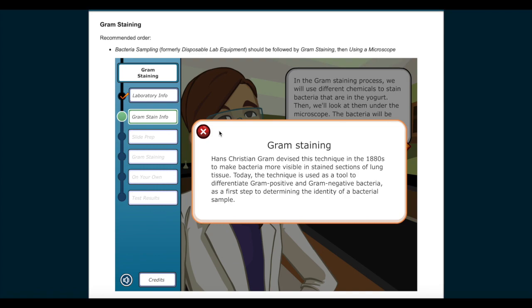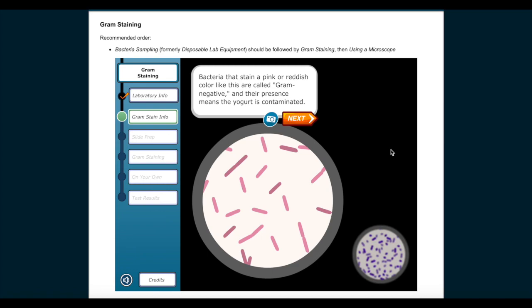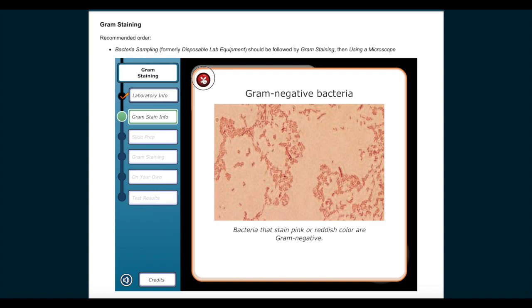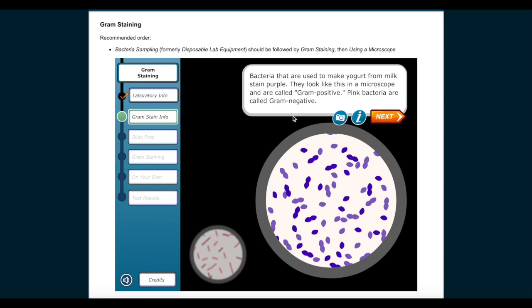Bacteria that stain a pink or reddish color, like this, are called Gram negative, and their presence means the yogurt is contaminated. Bacteria that are used to make yogurt from milk stain purple. They look like this in a microscope and are called Gram positive. Pink bacteria are called Gram negative.